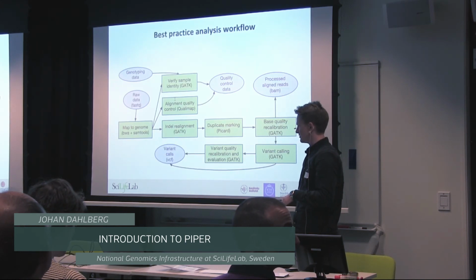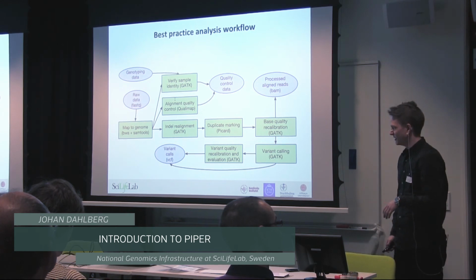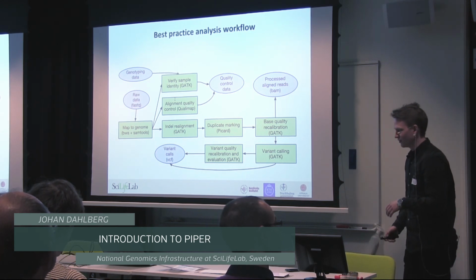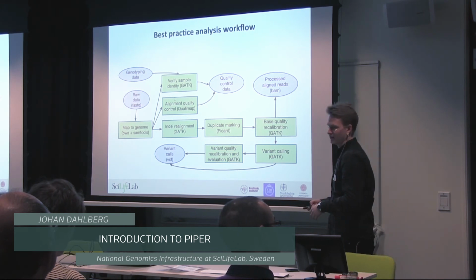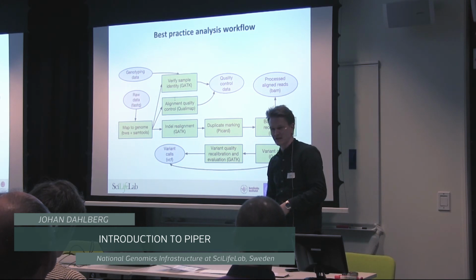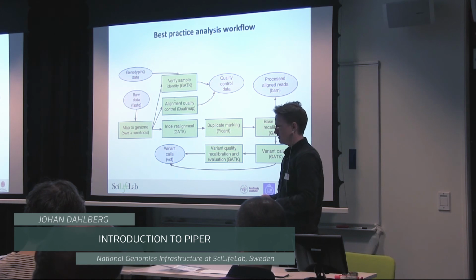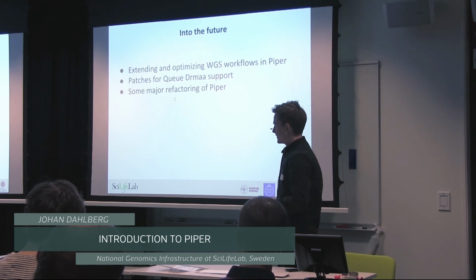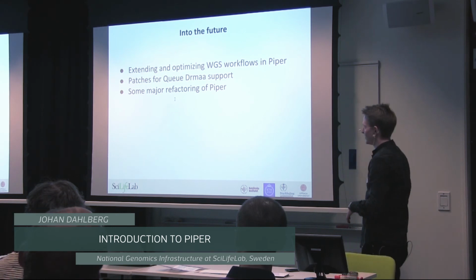And this is currently what we're working on, and I think this will be familiar to a lot of people. So we're currently working a lot on extending and optimizing our pipelines for whole genome sequencing and managing that in as efficient a way as possible, looking to meet the demands that are placed upon us by these really nice machines. Into the future, that's what we're doing right now.